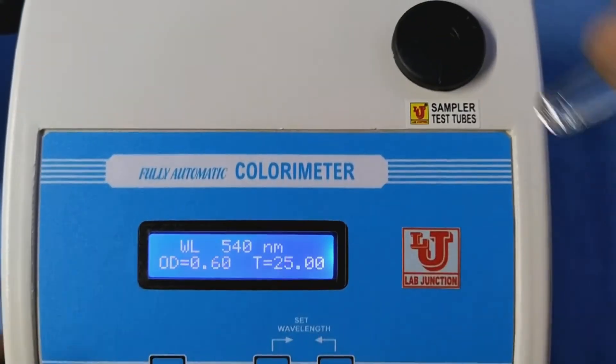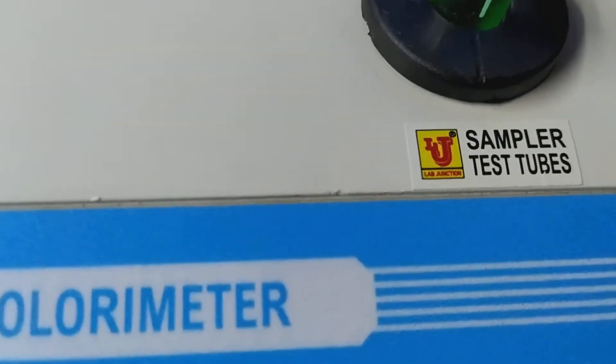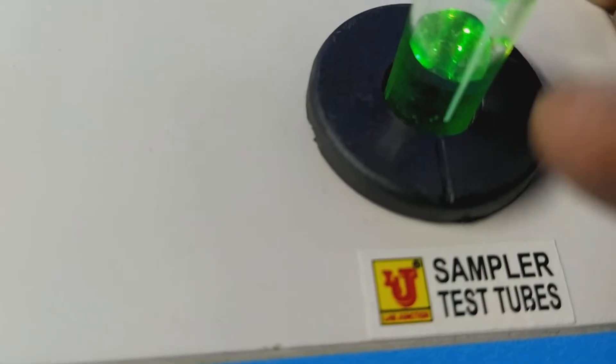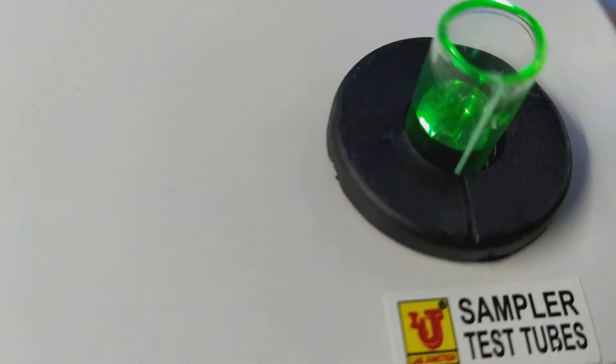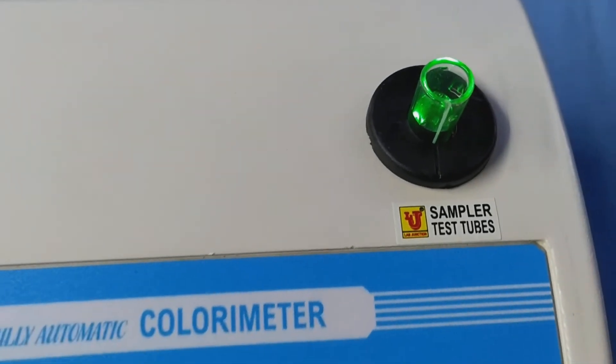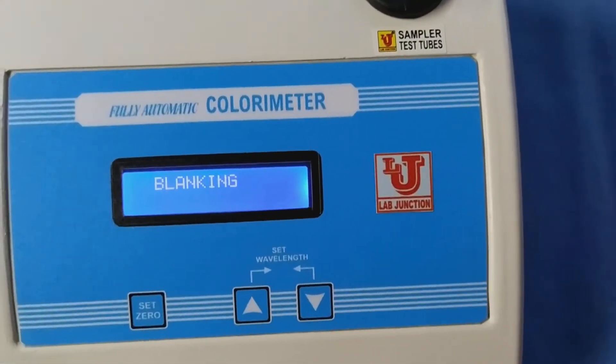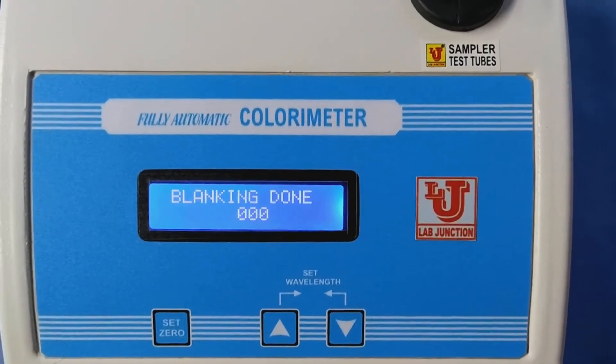Now, insert test tube. Please coincide test tube mark with this mark and completely insert. And press set zero. Blanking done.